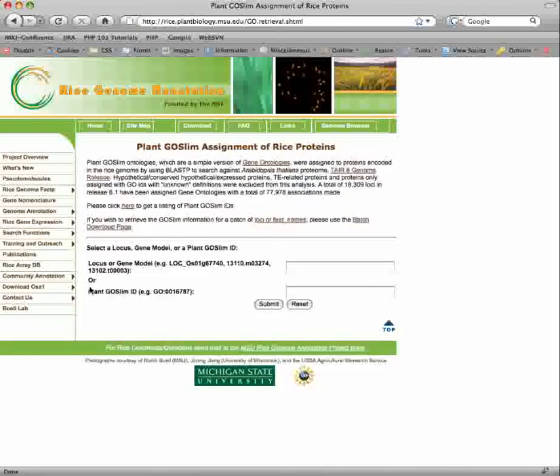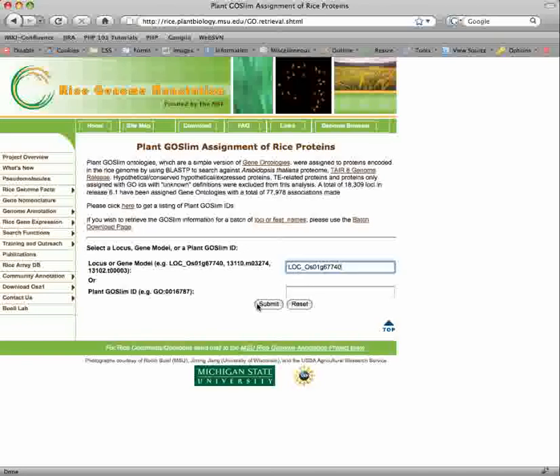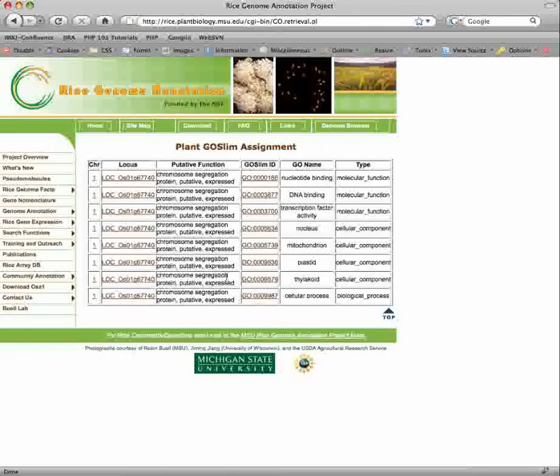We have annotated our loci with gene ontologies, specifically the plant GO slim, which are a higher level of annotation. You can find the GO slim annotation associated with a gene model or locus by inputting the locus or feature name. The output is the chromosome, locus ID, and putative function of the locus, along with the GO slim ID.